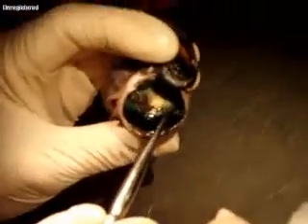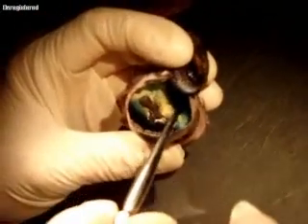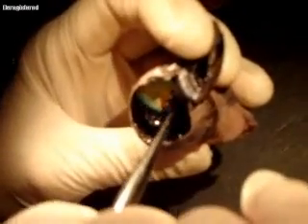The lens is right here. There's the lens right here. And if you look on the inside, it looks almost like an abalone shell. This layer, and you can actually move it if you put your probe against it and move it. This is all choroid, it's the vascular layer. And then this stuff that's all bunched up here, sort of gray and gnarly looking, that would be the retina.